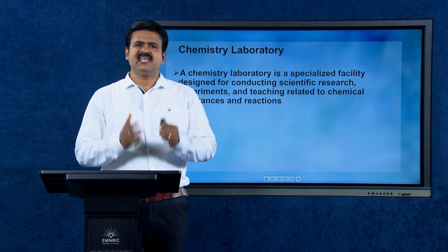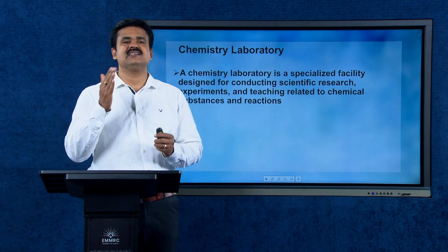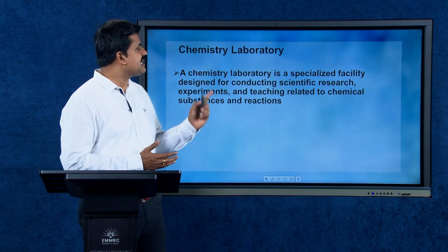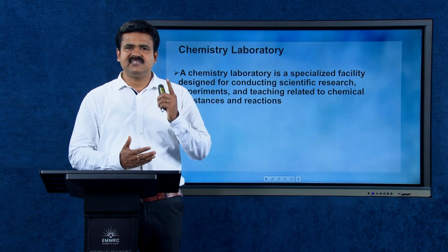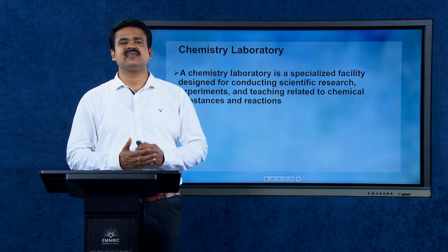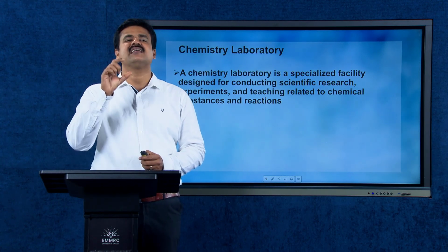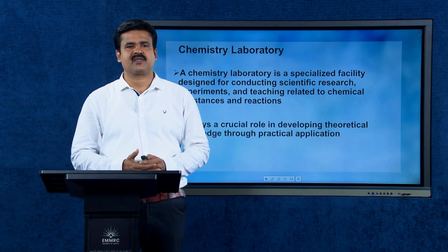Now, a chemistry laboratory is a specialized facility designed for conducting scientific research, experiments and teaching related to chemical substances and reactions. This is a clear-cut definition of a chemistry laboratory.